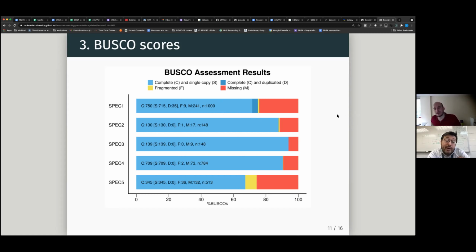So we can identify this duplication. I mean, Julia, are we going to talk about this? There is a slide. Yeah. So we can talk about it later, how we remove them. But yeah, we see that in birds, especially in wild caught birds. I don't think we see that much in zebra finch, but maybe I'm wrong.